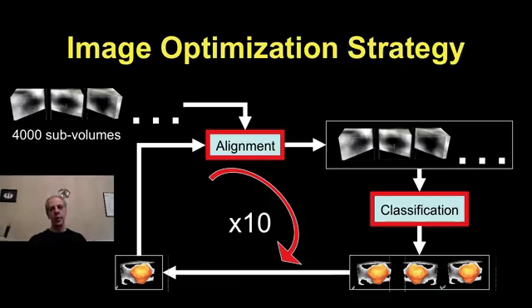We're going to cluster them again. We're going to align them again. And we're going to cluster them again. And you repeat that for a number of iterations until you're satisfied either that things are not changing too much, or basically you say, this is the best I can do, so I'm going to stick with that. And that's the process. We define a distance, we do alignment, clustering, alignment, clustering. And the big thing here, once again, and we're going to come back to that again and again, is we have a lot of these small boxes.